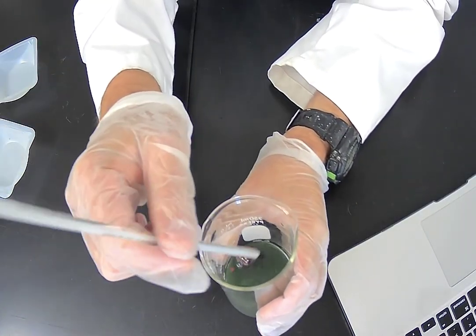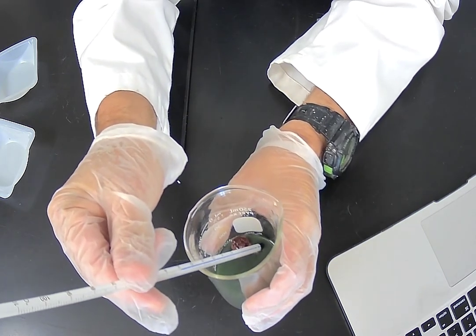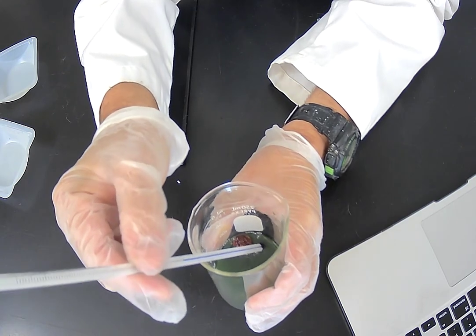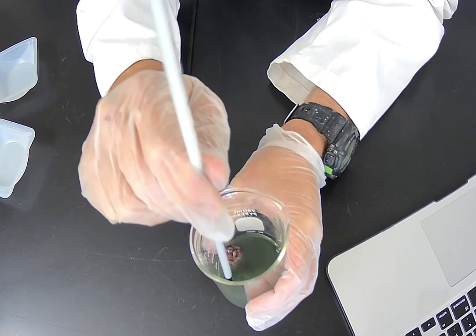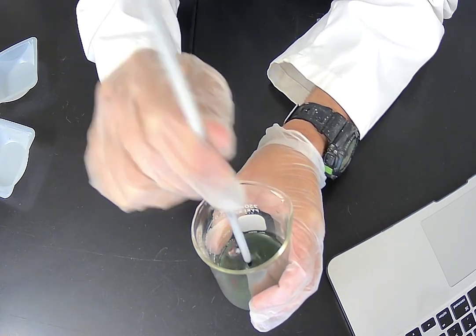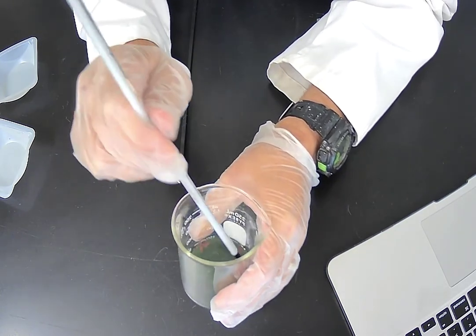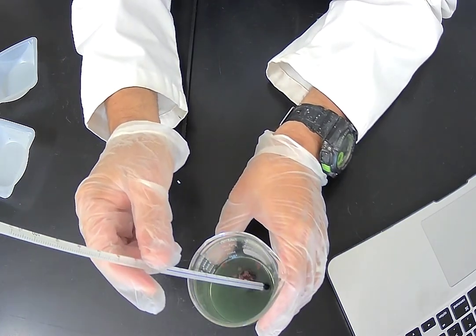The bottom of the beaker is warm to the touch. I can definitely feel that heat is being generated, and I'm getting more and more of that brownish substance forming on my foil. A lot of students that have done this lab have told me it looks like rust. It looks like the aluminum is dissolving.